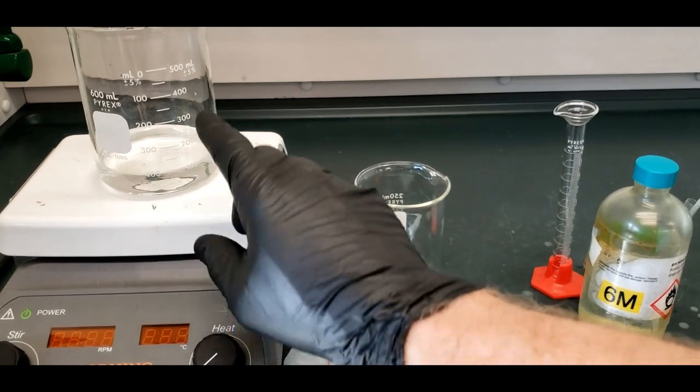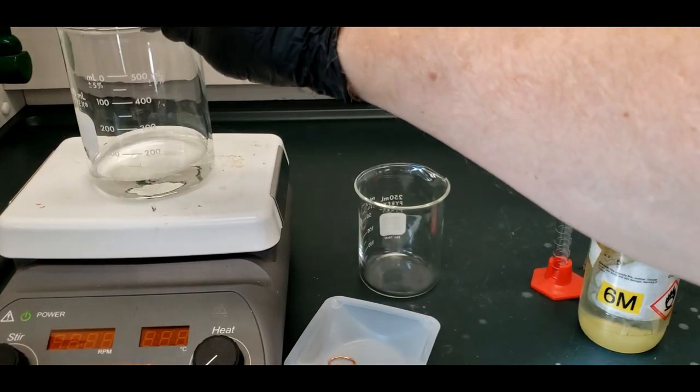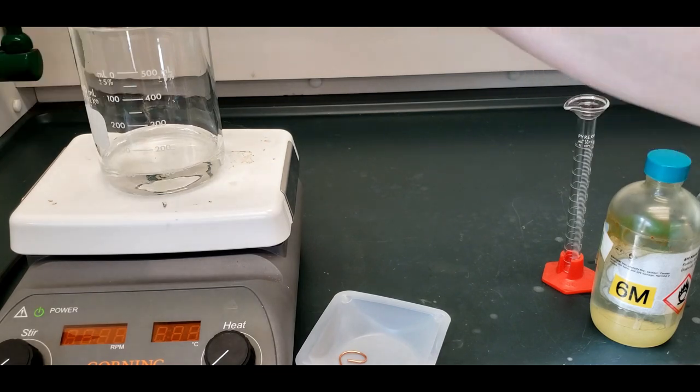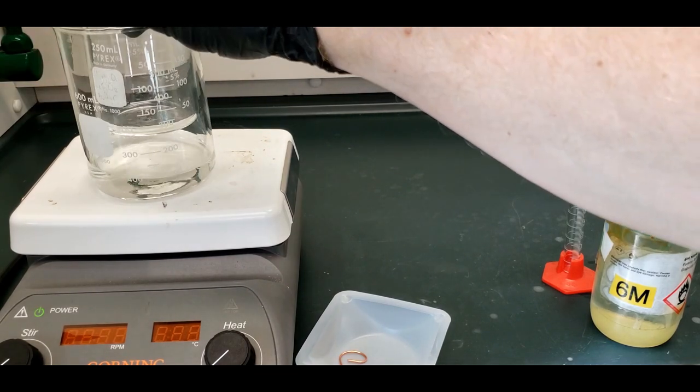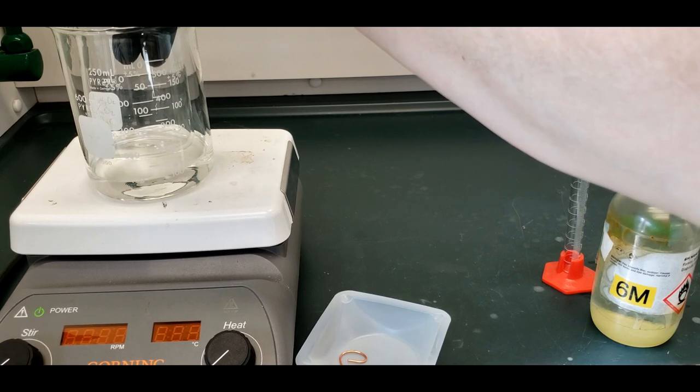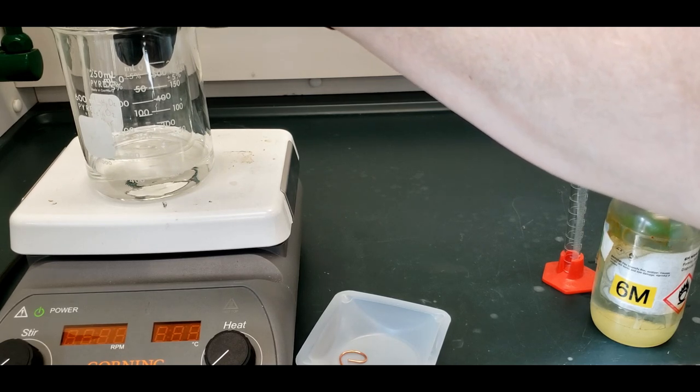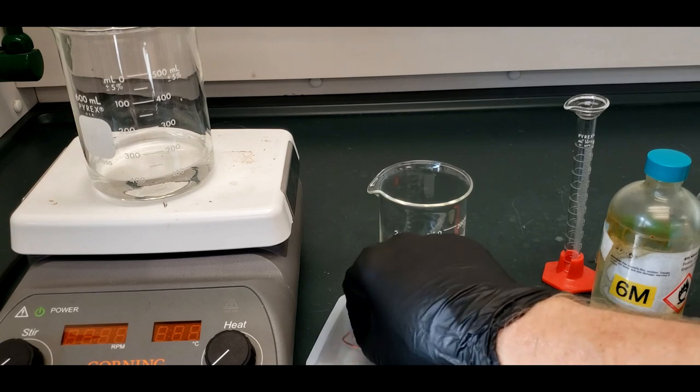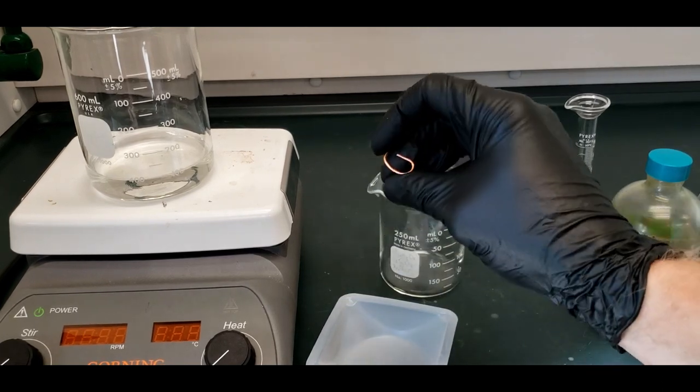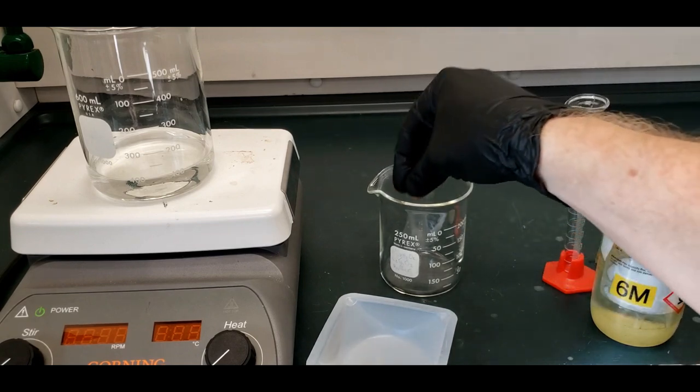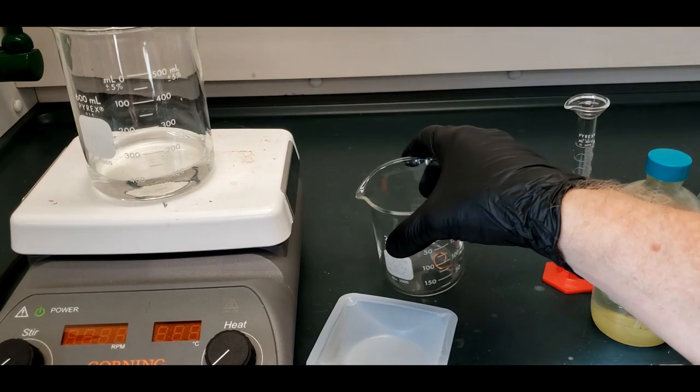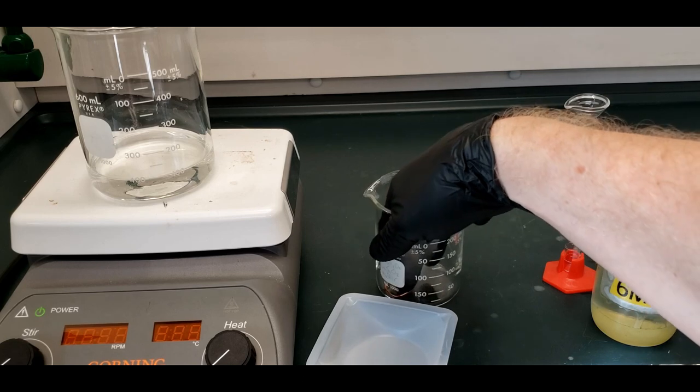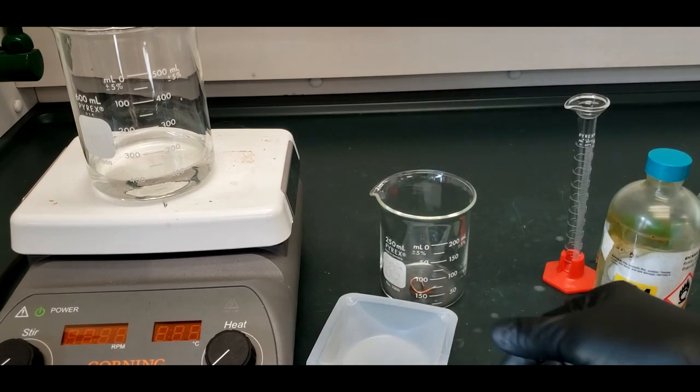We have our hot plate with our beaker of water, 100 mils of water, and a 250 mil beaker we're going to put inside this beaker. The beaker inside only gets so hot, the most it's going to get is 100 degrees Celsius. We don't want the nitric acid evaporating away. I took the wire we just measured the mass of and bent it so there's no chance it's going to get stuck against the walls.